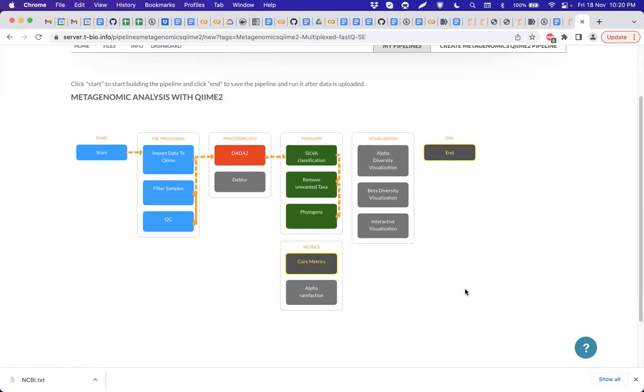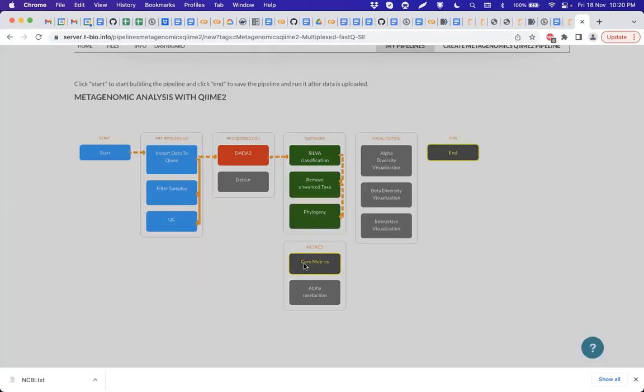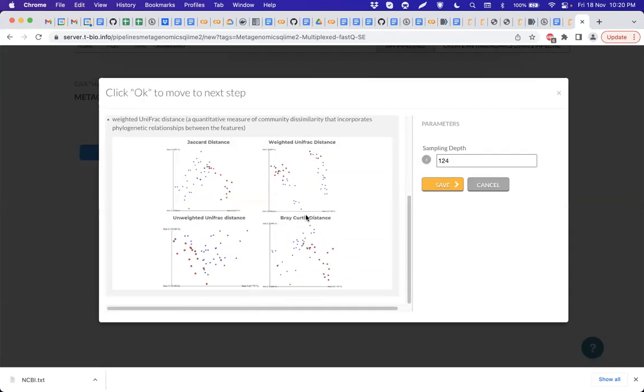So I selected that by mistake because I've been setting up some RNA-seq pipelines, and it came by habit. So let's, yeah, then by core metrics, in this data you're using, does the quality of reads drop as you go along the sequences? No, the quality of reads doesn't drop here also.